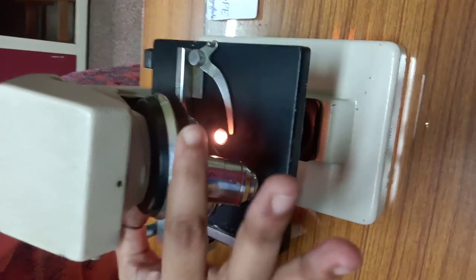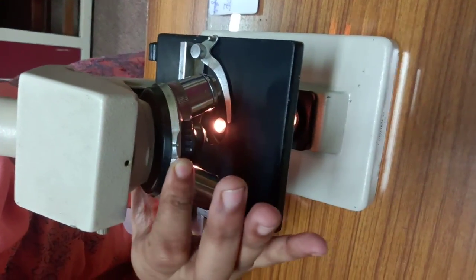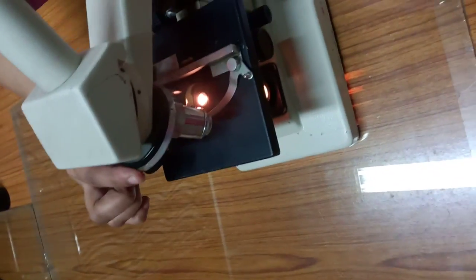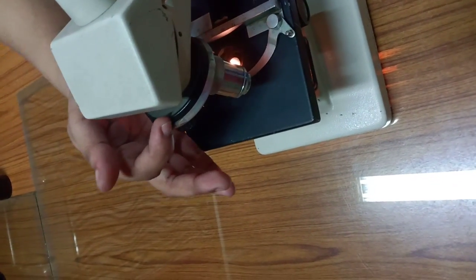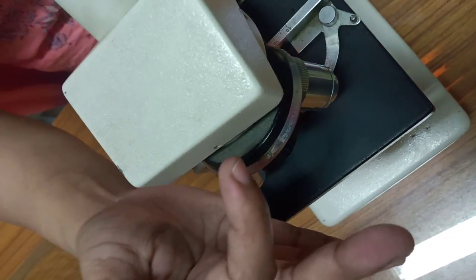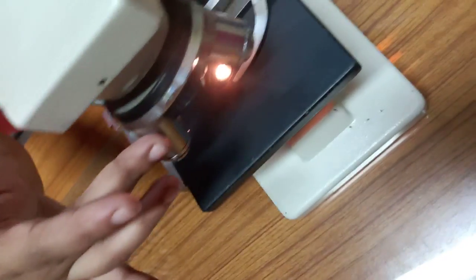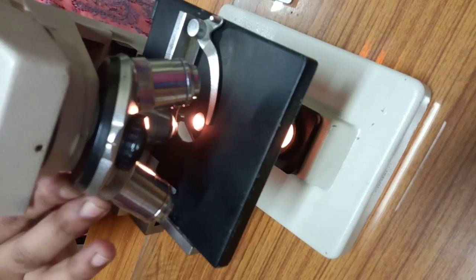Revolving. Why? Because it can revolve. This is the revolving nose piece. It is also known as the objective turret, revolver or revolving nose piece. As we see in our physical body, the nose is the part of the face on which the lenses that we put are resting. Similarly, the magnifying lenses that you are seeing here are resting upon the revolving nose piece.